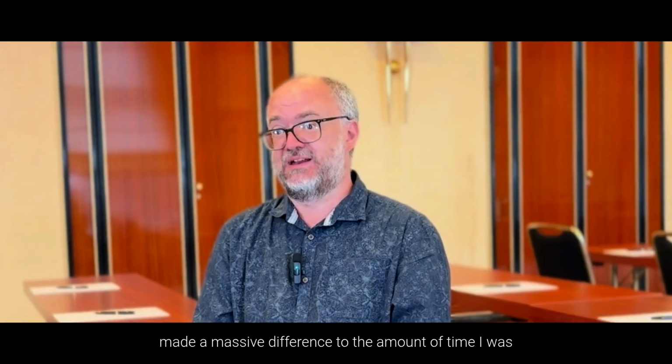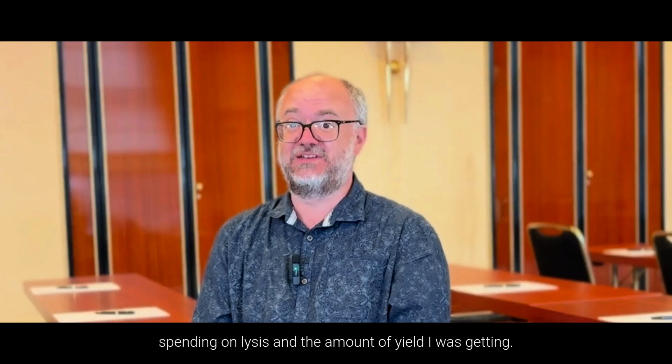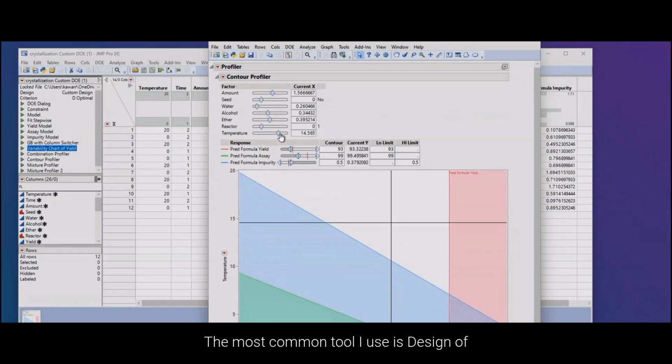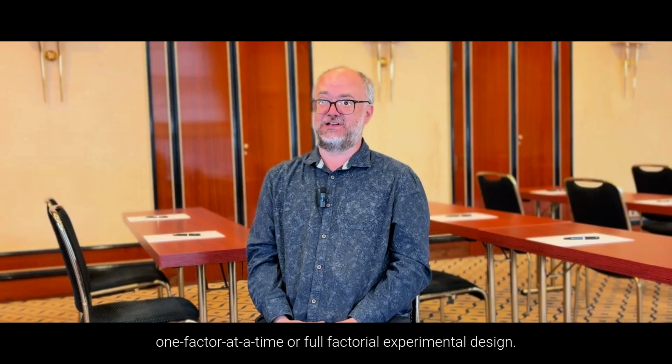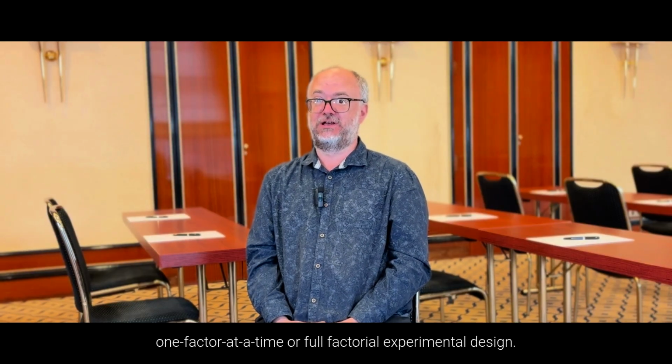It was really simple, but it made a massive difference to the amount of time I was spending on lysis and the amount of yield I was getting. The most common tool I use is design of experiments to try and get away from the 1 factor at a time or full factorial experimental design.